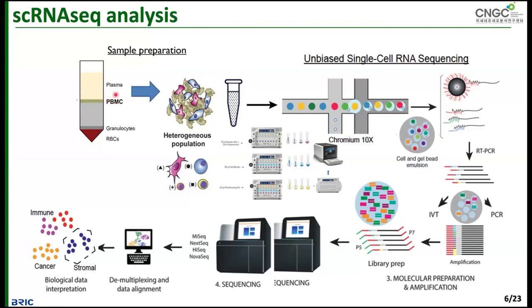to isolate only the PBMC. And after isolating the PBMC, when you check under microscopic observation, you can see different types of cells. It's not homogeneous. Homogeneous means it's the same type of cell. This is a different type of cell, like I said, B cell, T cell, NK cell, CD4 cell, CD8 cell, something like that. There are so many different types of cells.